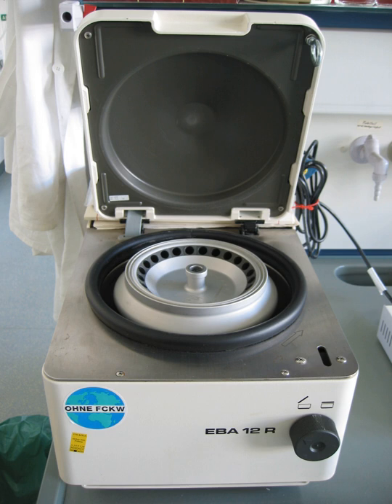Microcentrifuges, devices for small tubes from 0.2 milliliters to 2.0 milliliters, microtubes, up to 96-well plates, compact design, small footprint, up to 30,000 g. Clinical centrifuges, moderate speed devices used for clinical applications like blood collection tubes. Multipurpose high-speed centrifuges, devices for a broad range of tube sizes, high variability, big footprint. Ultracentrifuges, analytical and preparative models.